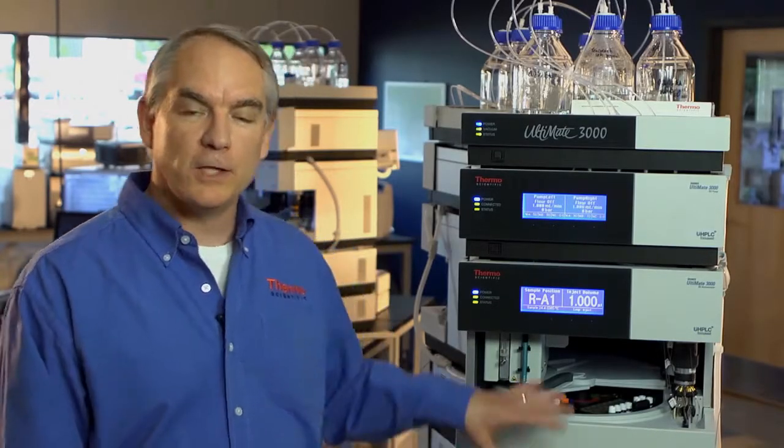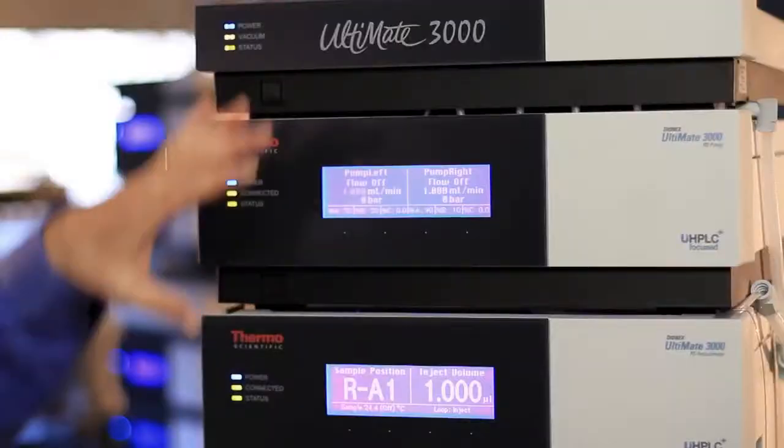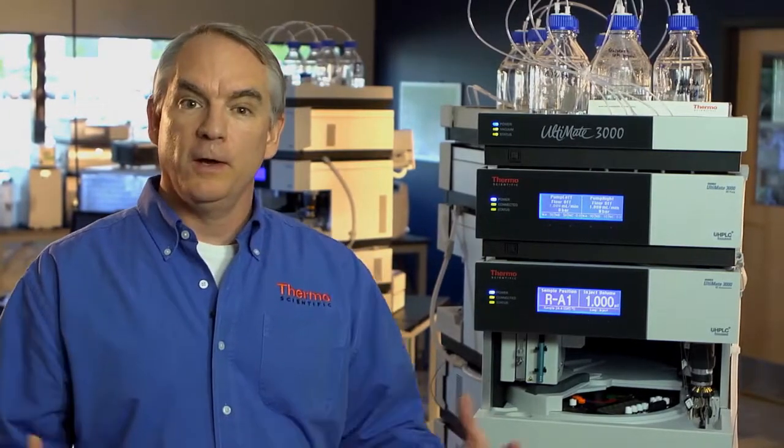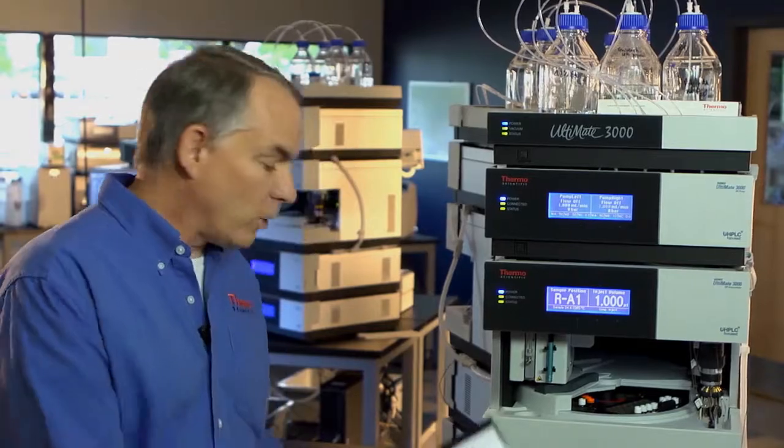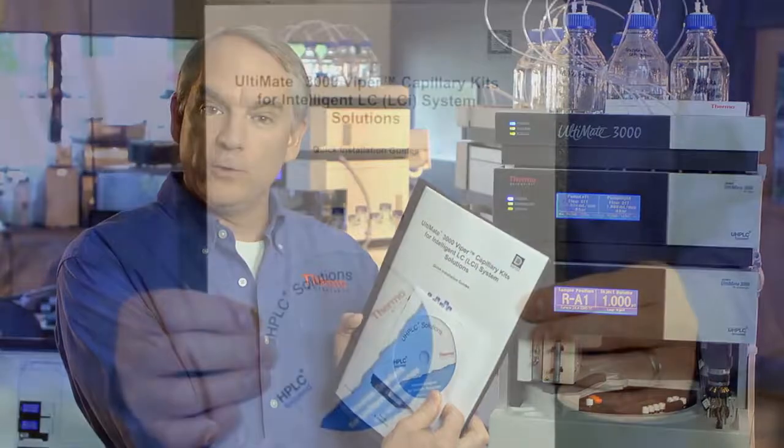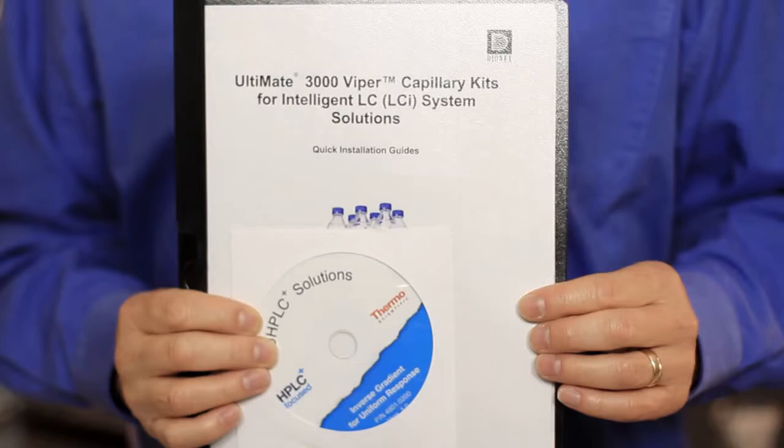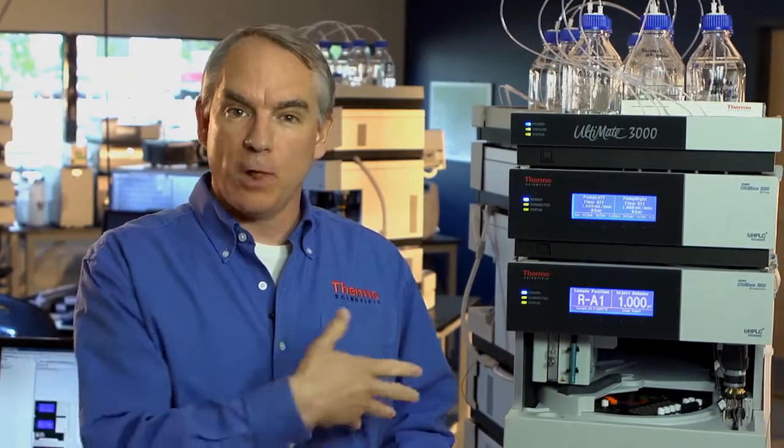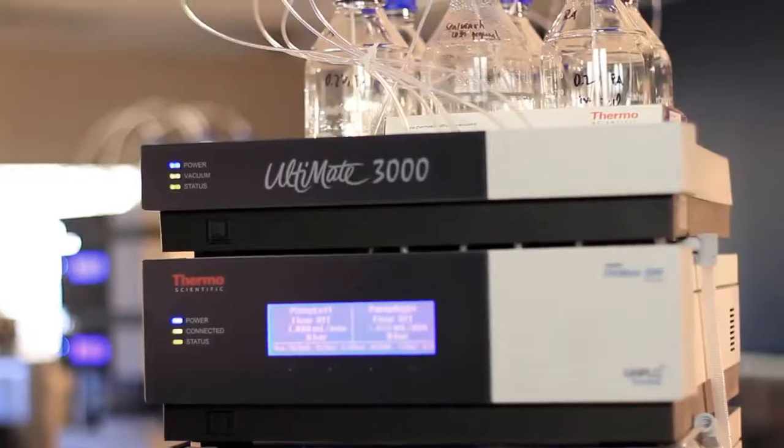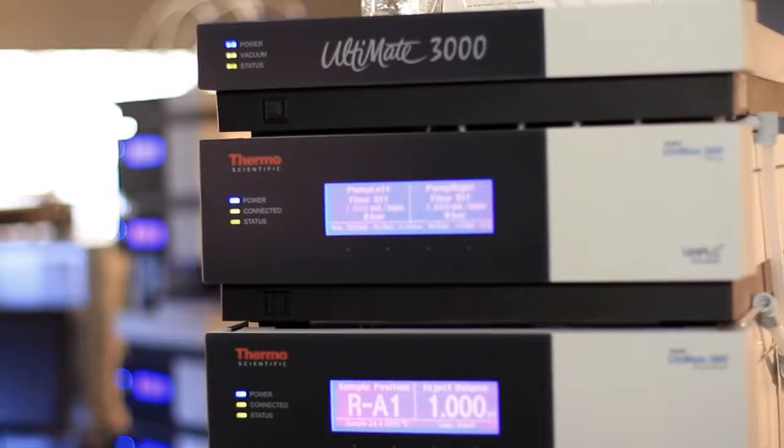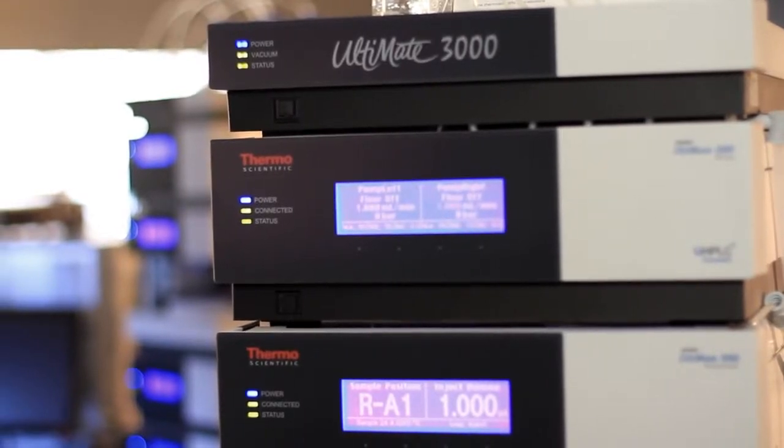Let me emphasize that the HPLC system is just one part of a complete turnkey package that includes not only the instrumental system but a chromatography data system, Chromelion, that has built into it very simple wizards that make it easy to set up online solid phase extraction methods. It also includes a well written and easy to follow manual and instructions, and a Viper capillary plumbing kit that includes everything that you need to plumb the system up for online solid phase extraction.